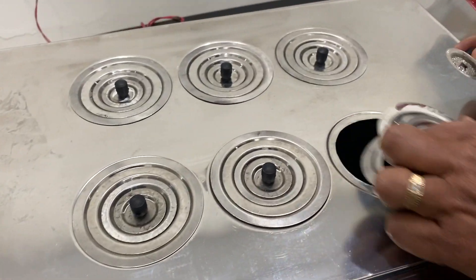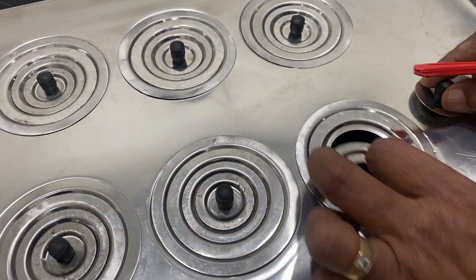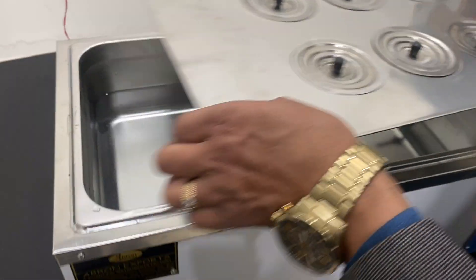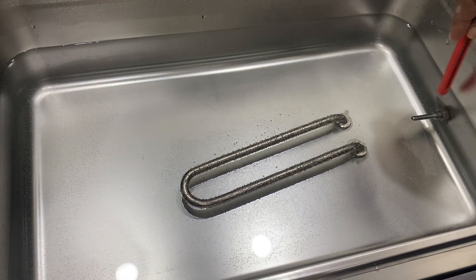This has a concentric ring so you can place different size items. You can place a beaker as per your requirement. Let me show you inside — this is the thermostat inside.